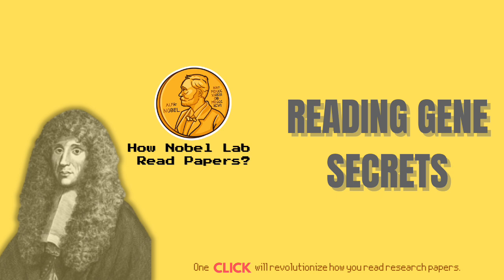Right. And the algorithmic side was huge. They developed custom software, the RNA-Seq mapper. This thing was clever. It didn't just align reads to the genome. It used a seed and extend approach to specifically find those reads crossing exon boundaries. This allowed de novo splice junction discovery, finding new splice sites without needing prior annotation, with really good accuracy, down to 2 base pairs. That was a major computational leap. And as we said, introducing RPKM gave everyone a standard way to quantify and compare results.